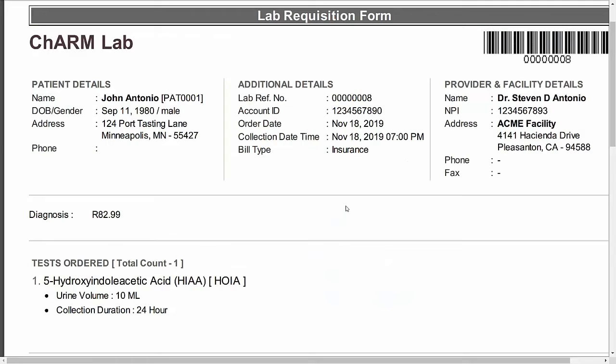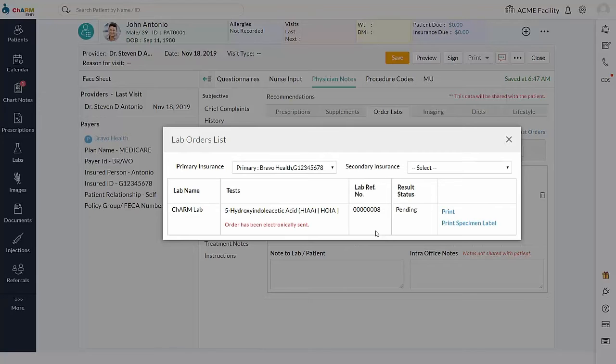If the specimen is being collected at the integrated lab's patient service center, printed order requisition copy can be handed to the patient. In lab's patient service center, lab staff pulls the associated electronic order from lab's system and draws the specimen from patient being tested. Else, if the specimen is being collected at a practice in-house laboratory, specimen can be collected in practice and it can be transported to integrated lab for testing.